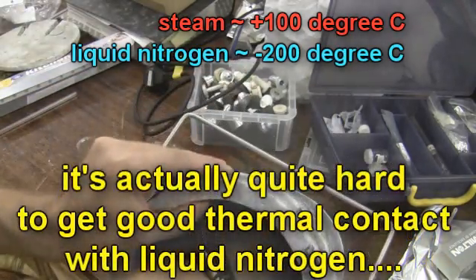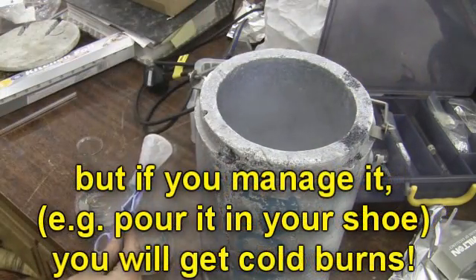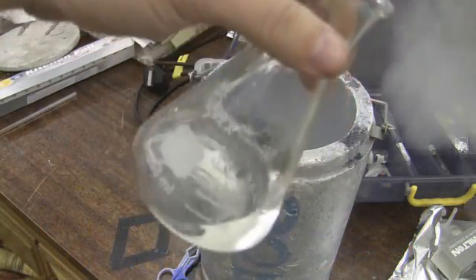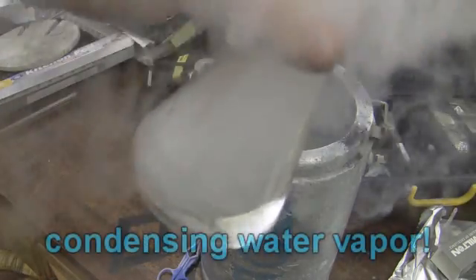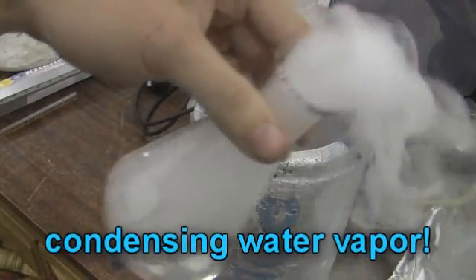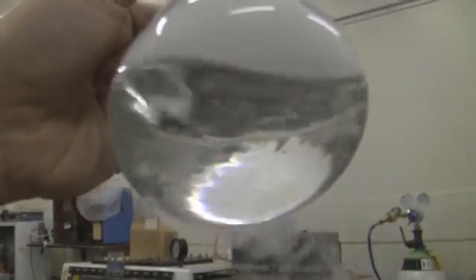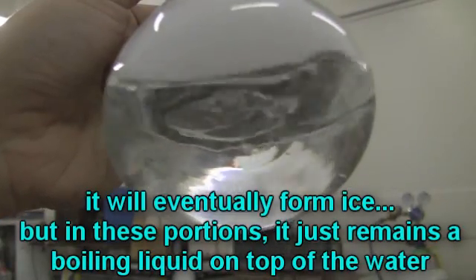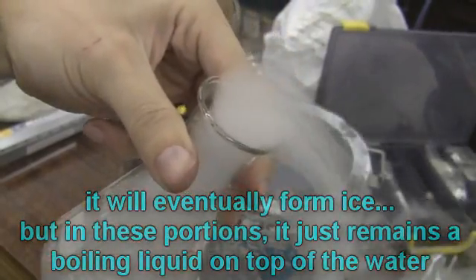Let's get some more nitrogen and this time pour it in some warm water and see what happens. As you see, it boils off. And if you get underneath that, what you should find is you should be able to see the liquid nitrogen floating on the surface. That's it floating on the surface, boiling away. So that's liquid nitrogen and water.